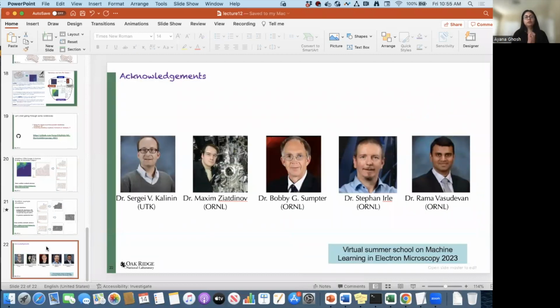I hope that from lecture 12, we were able to see how we can train ensemble networks to go from microscopic images to feature extraction, and that can adapt to different imaging conditions later on, and then use that type of information to pipe that data into the simulation environment. This is our way to connect theory and bring that in the loop of having this end-to-end workflow, connecting both experiments and the theoretical domain to develop a comprehensive understanding of the material systems that we want to learn.